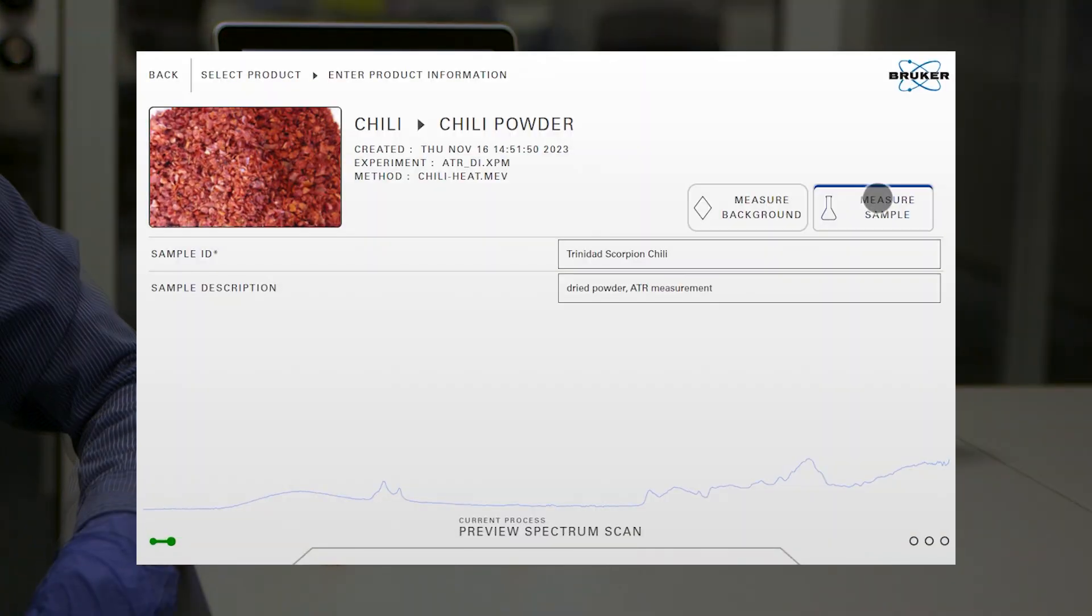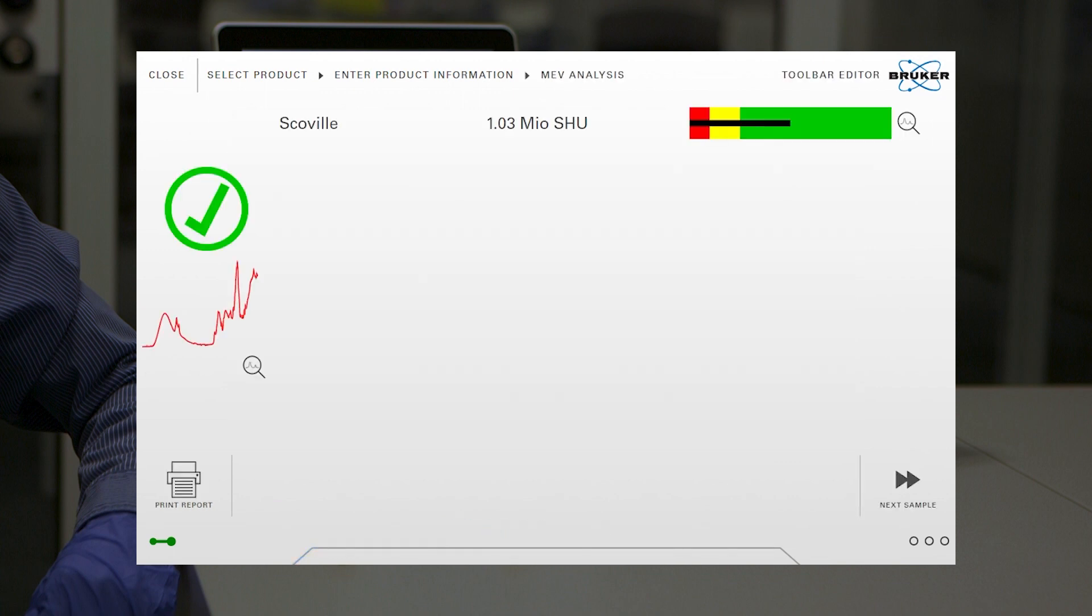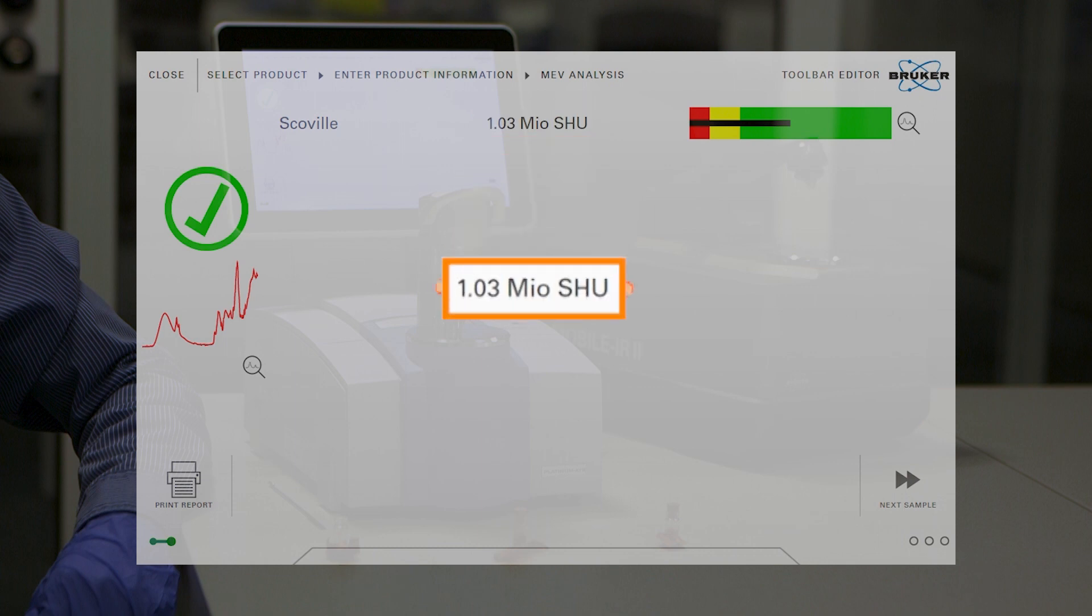We start the measurement and after a few seconds we get our result. The Alpha 2 tells us that this chili powder boasts an astounding 1 million Scoville units.